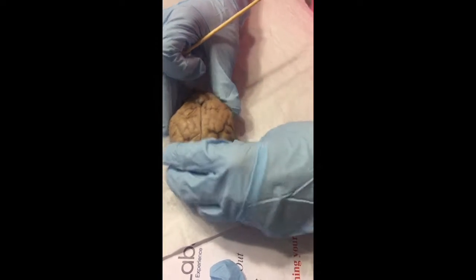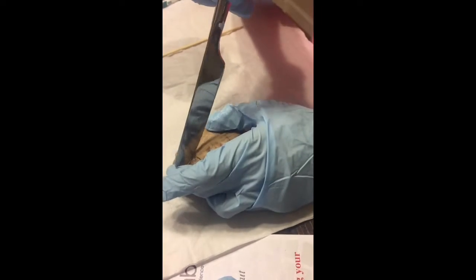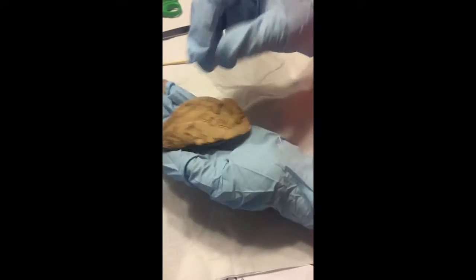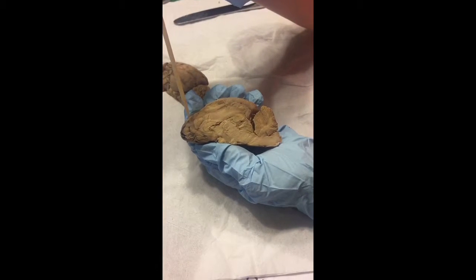Okay, next we're going to do the frontal lobe, after we cut down the middle. It's a perfect cut. Alright, so we're looking at a cross section here. The frontal lobe would be right here.